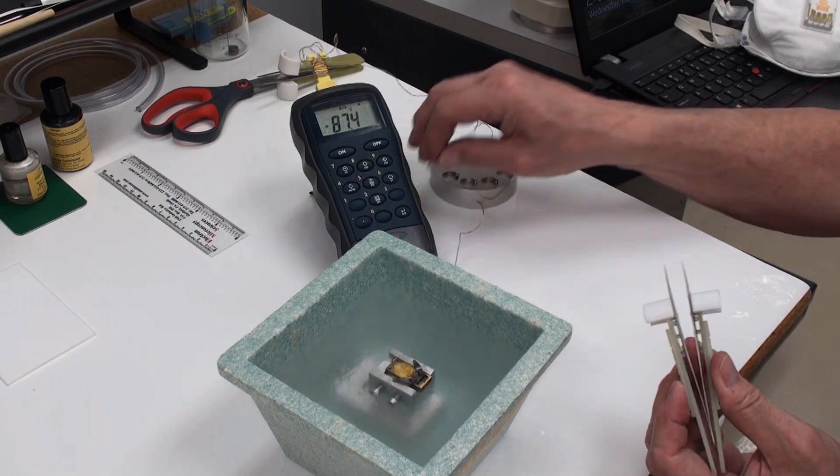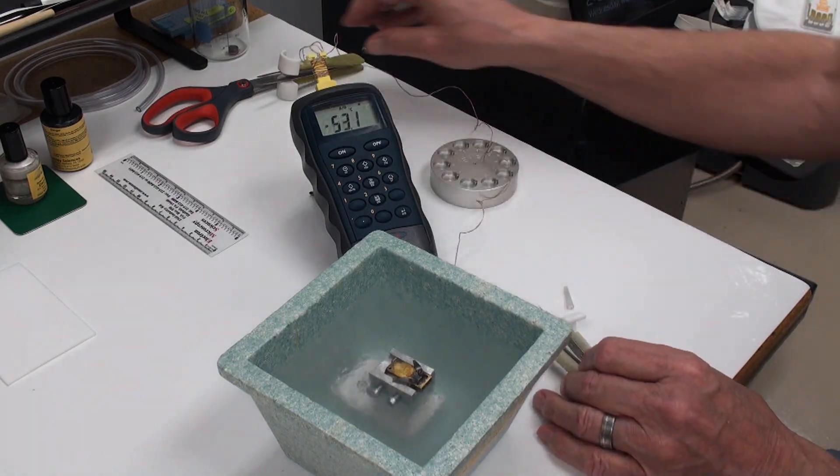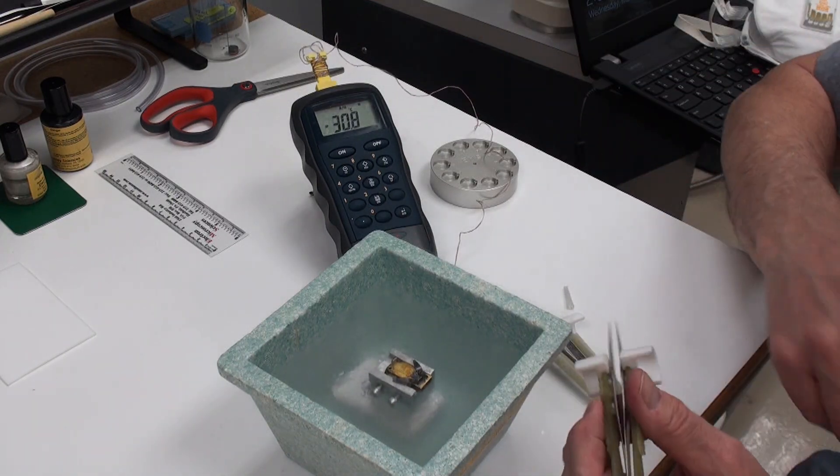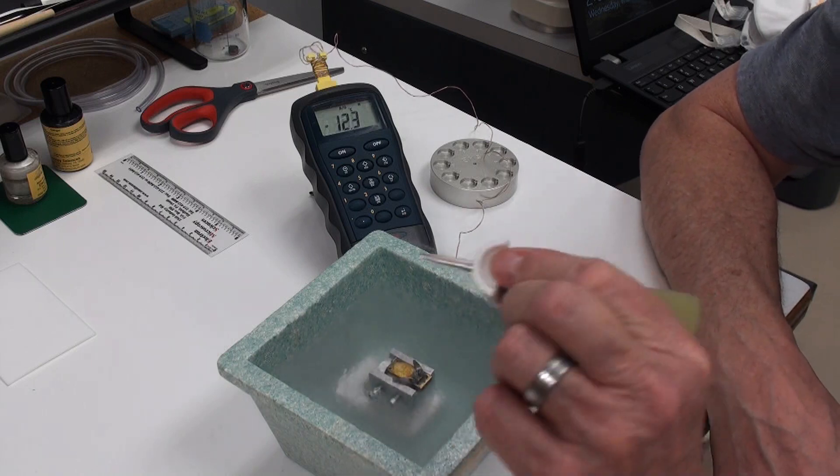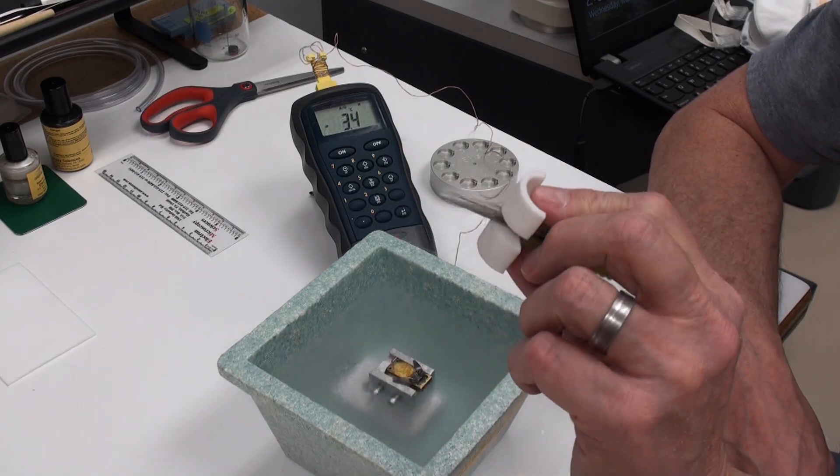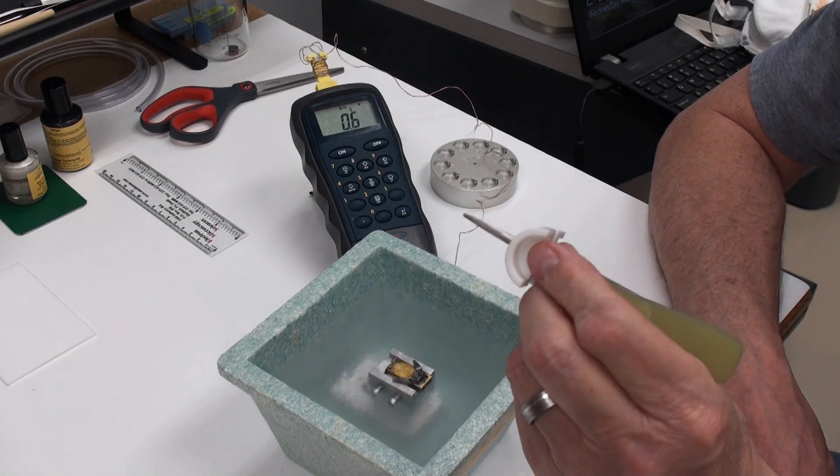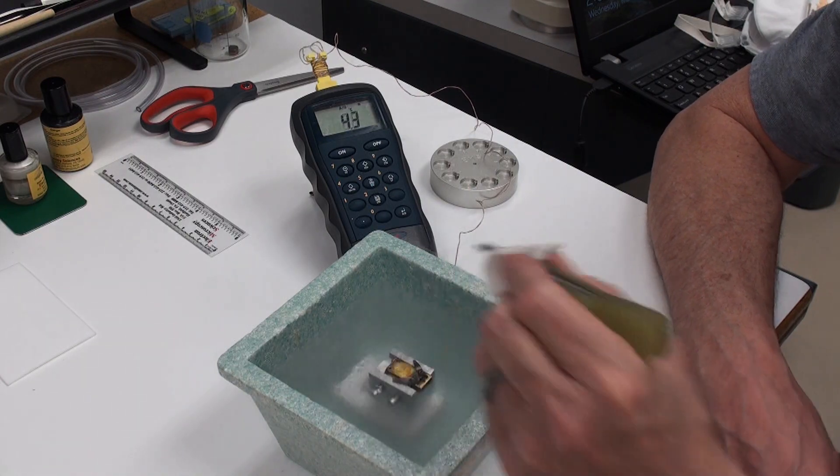These are number five tweezers. Personally for cryo, I like using a number two. These are currently not available. This was just my prototype. It was my personal preference.